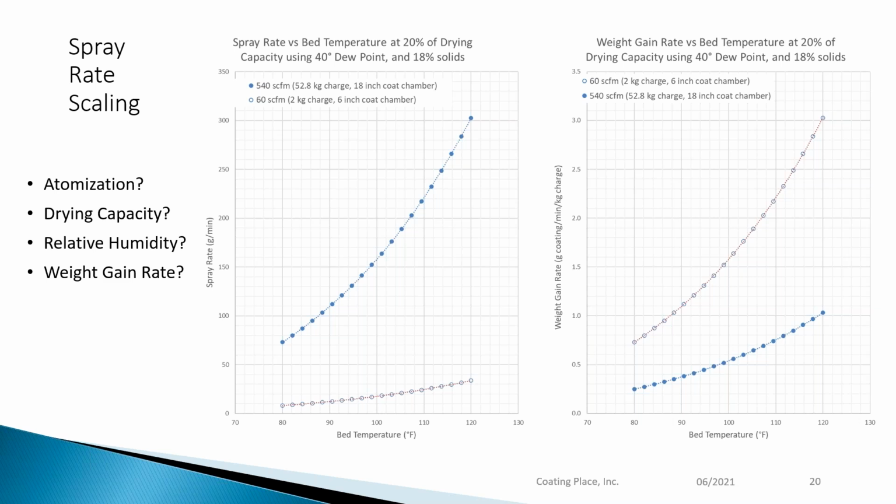You might have to use a different pressure. When you are using different pressures, you're going to be introducing different physical forces on the particles. And so you can get variations associated with how much you beat the particles up with that. Drying capacity is about the capacity of the air to remove the vapors of a solvent that you're using. And sometimes matching that is critical.